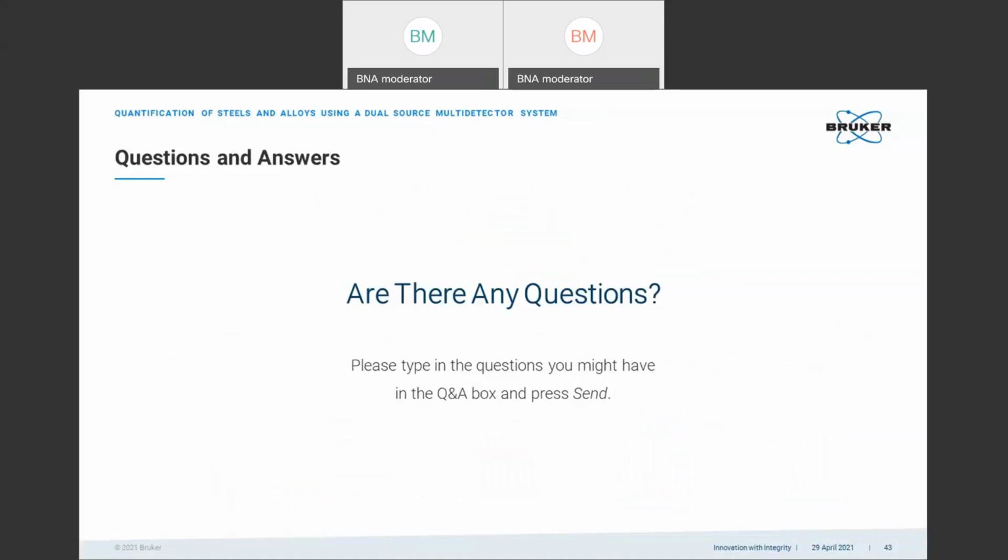So a question that's come through is, Michael, I think this one's for you. What is the operating kV required for WDS analysis and accurate quantification?